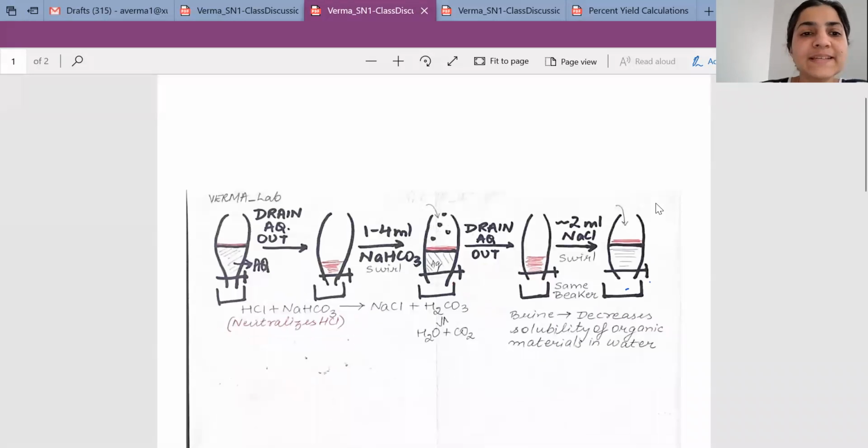Once you have completed your reaction in the Erlenmeyer flask and you have poured your material into the separatory funnel, you will then use various salts to work up and extract out your organic layer in a shell vial. You can label this first shell vial as V1.